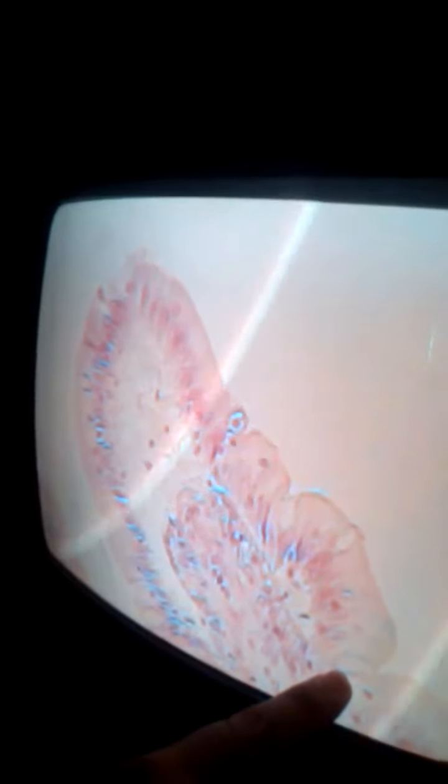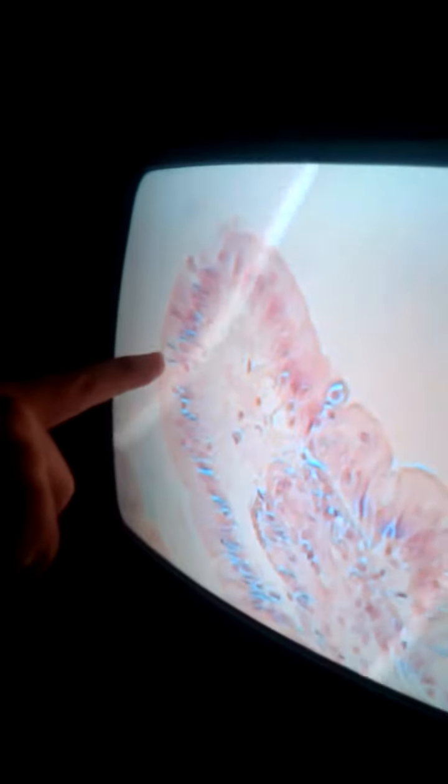There's one here, there's one down here, there's one down here, and another one over here. Those are goblet cells. Okay? Can you point them out on here? Yep, absolutely. So the goblet cells, you'll see there's an oval right there. There's one down here. There's one over here. And there's another one over here. And there's actually one tucked in right over there. Those are goblet cells. Okay?